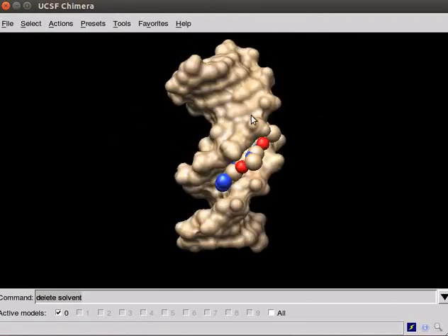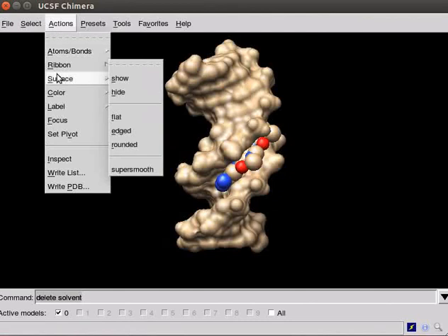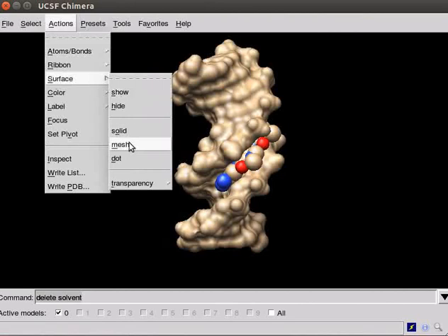There are three different ways to display surfaces. Scroll down the Action menu. Select Surface. Submenu has three options. Solid, Mesh and Dot. By default, surface is shown as Solid.